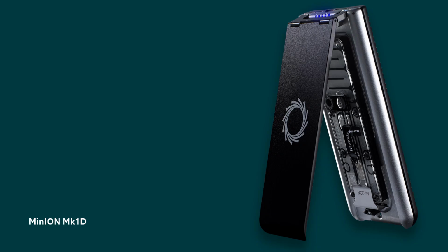Nanopore sequencing works by passing individual DNA molecules through tiny biological pores, nanopores, embedded in a membrane. As the DNA strands move through the pore, changes in electrical current are detected and interpreted to determine the sequence of the nucleotides. One important advantage of this technology is that it can read entire DNA fragments, from short segments to extremely long strands, in real time.